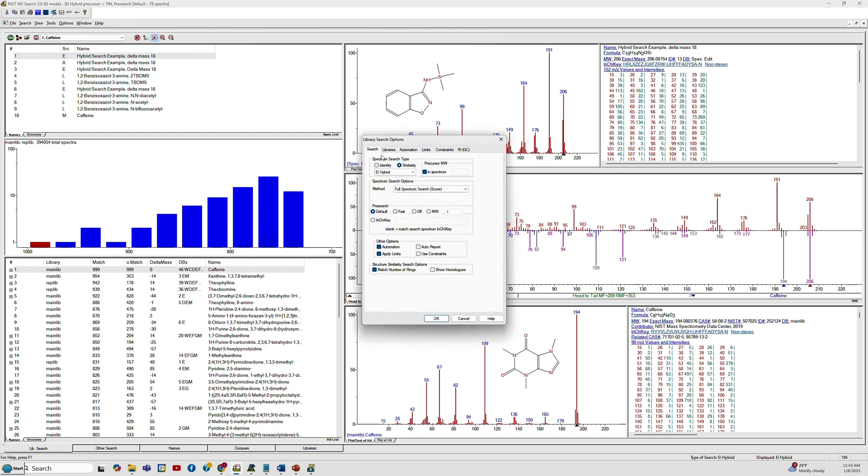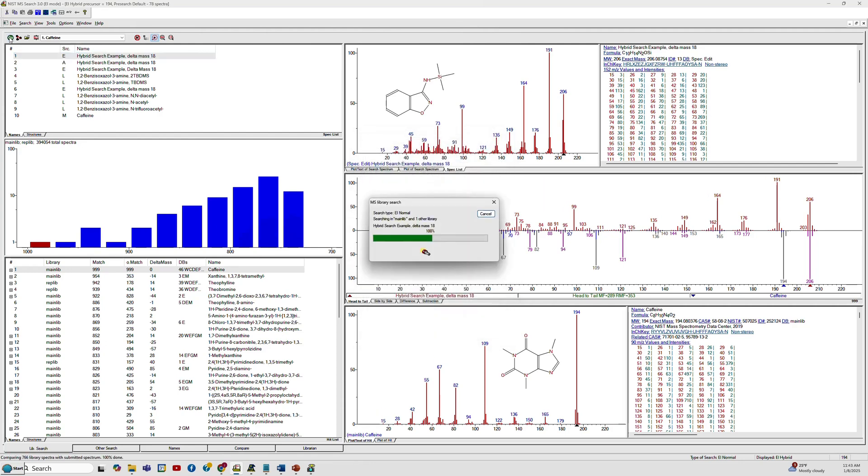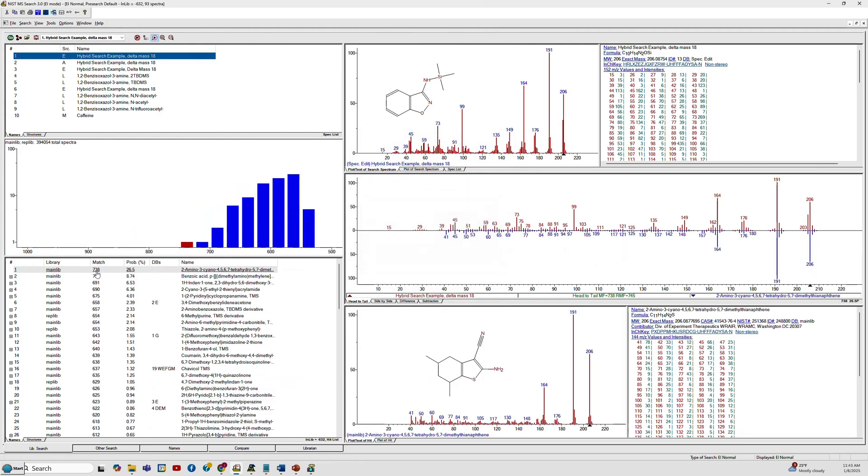So we'll go to the top and first do an identity search. That would be the standard type search, and when you do that you see that the best match down here is 738 out of a thousand, so not very good. If you look at the structure you can tell it's not related at all to our unknown on the top.